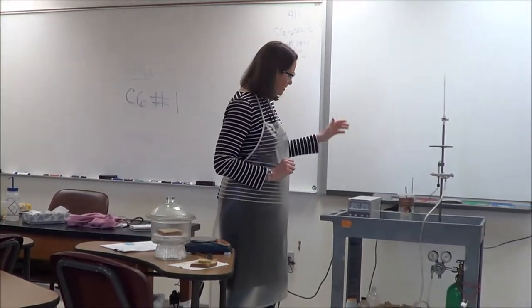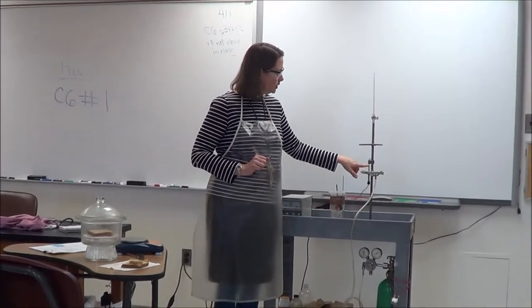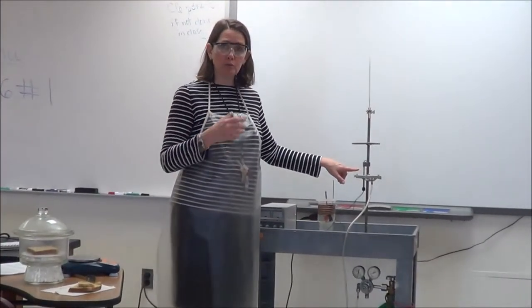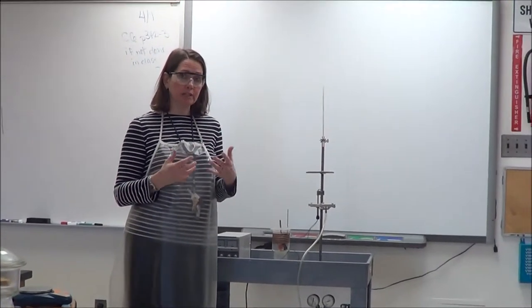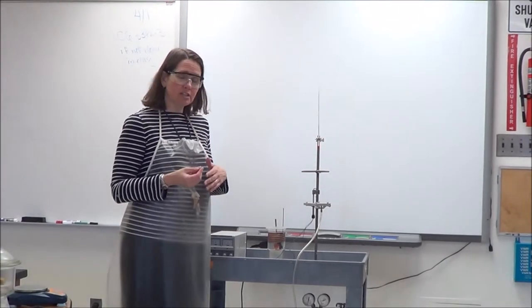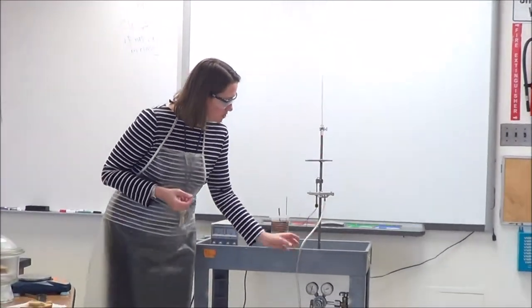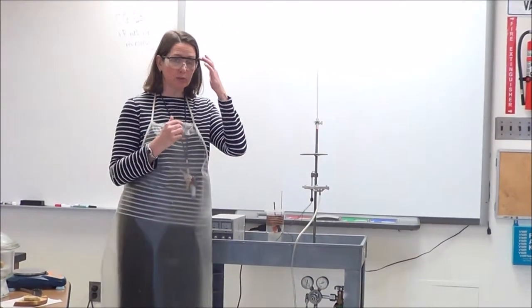To show you the calorimeter, how it works, we've got a power supply that connects to this coil. When I turn on the power supply, the coil will get red hot. The coil will be touching the bread in the crucible and it will ignite the bread to burn. The reaction needs oxygen to continue, so there is tubing connected to an oxygen tank down here that will be pumping oxygen into the calorimeter.